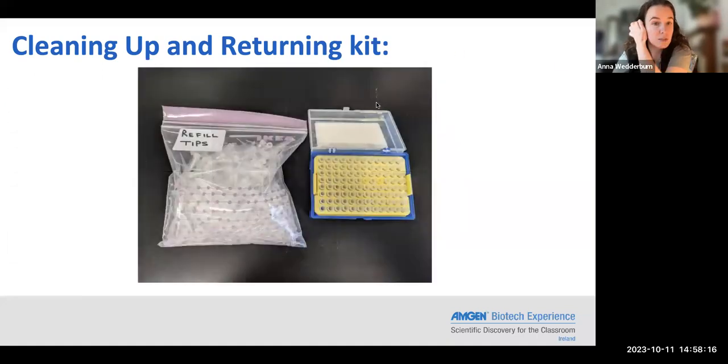It's also really important to fill up your disposable tip boxes. So we give you some refill tips, just put new ones back into the tip boxes so that they are full and ready to go for the next teacher as well.